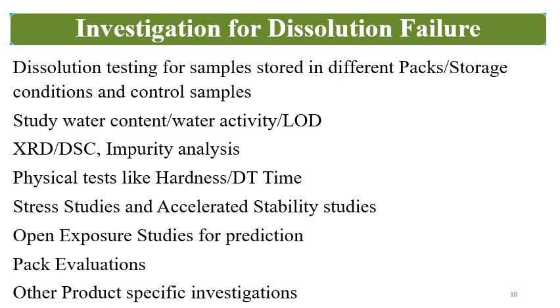Perform DSC or XRD to understand whether there is any change in the crystalline form or whether there is a change of amorphous form to crystalline form. Then impurity analysis will give you an understanding about the degradation. Then perform physical tests like hardness testing, disintegration time, disintegration testing. Then perform stress studies and accelerated stability studies so that proactively you can know whether there is an impact of storage condition on the dissolution.